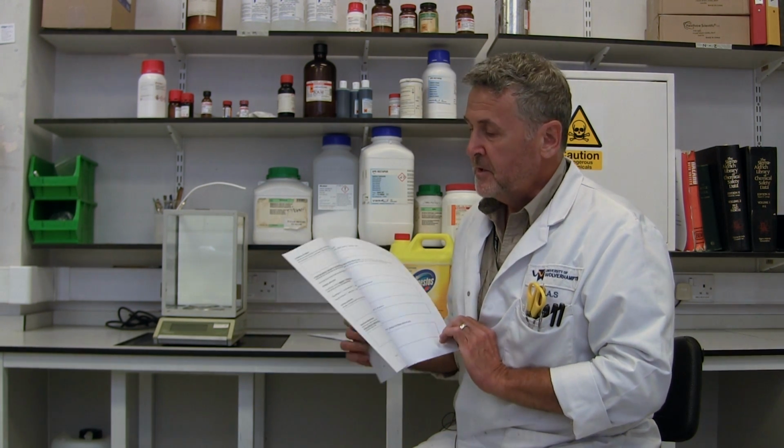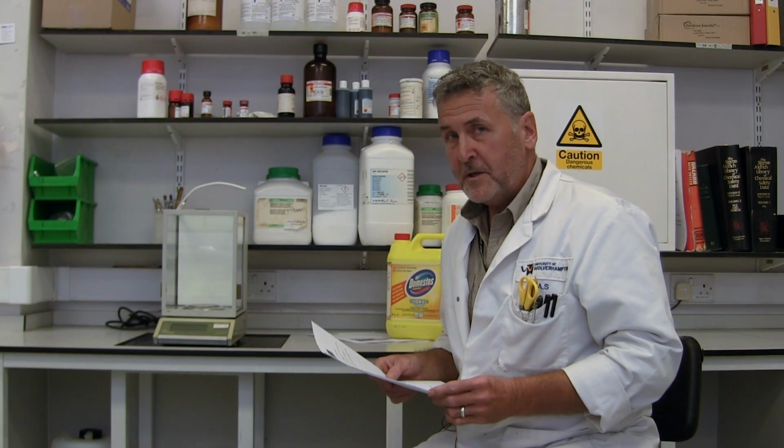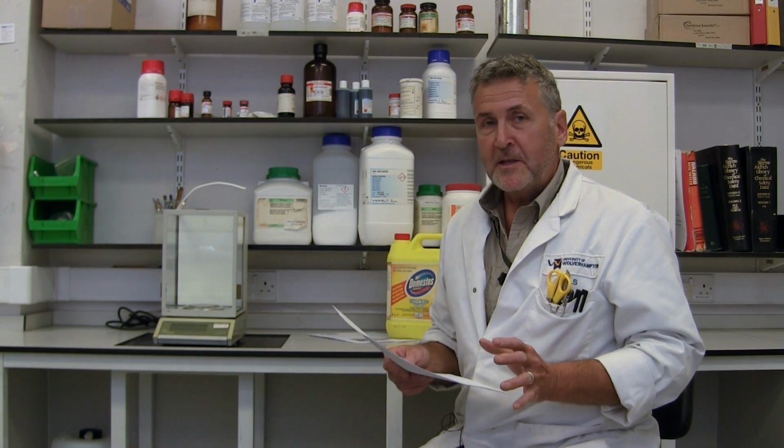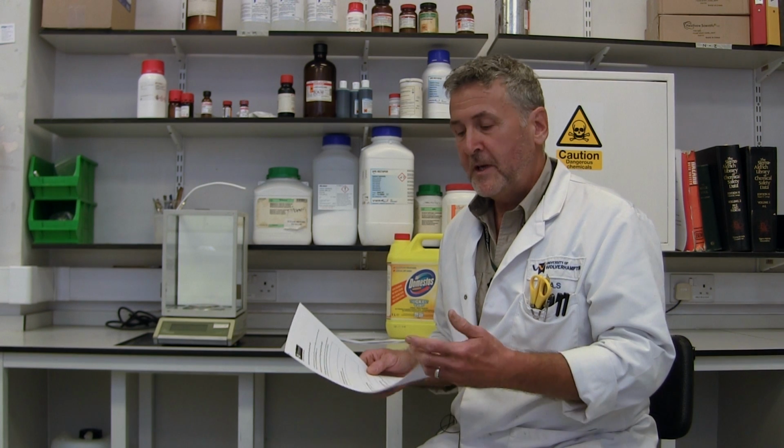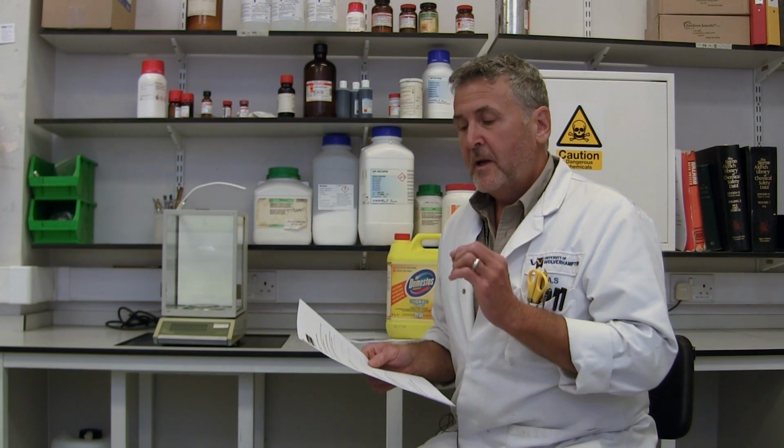Now, as you can see, it covers 4 sides. Don't worry about that. That doesn't mean there's a great problem in having to fill out 4 sides for every chemical, because once you're into the actual stream of running through this, getting the information and filling it in, it becomes quite simple. And a lot of it relies on common sense. I'm going to stress that point now.